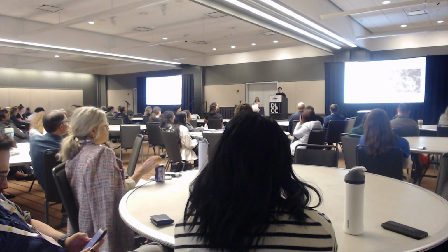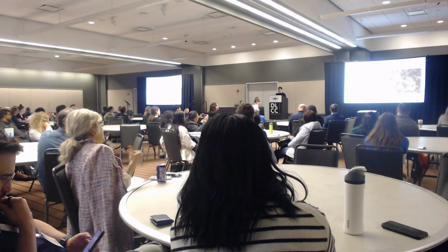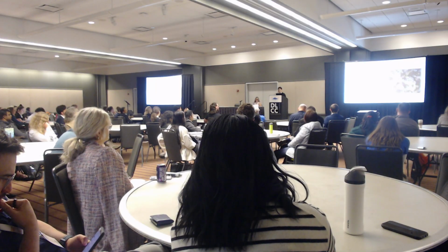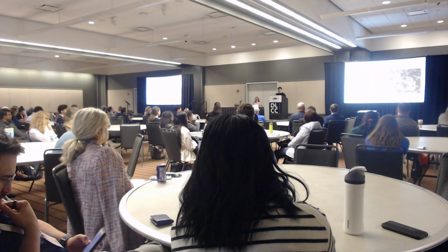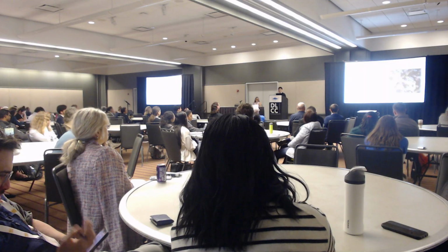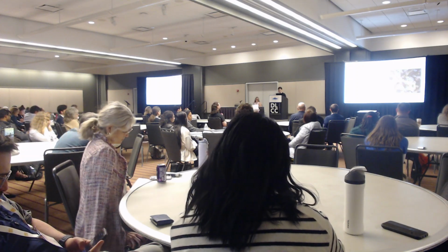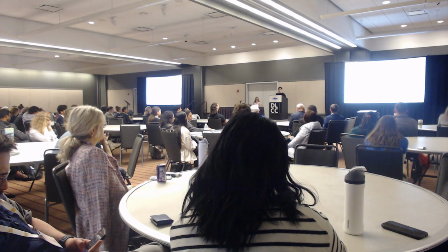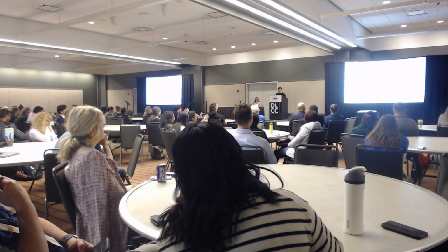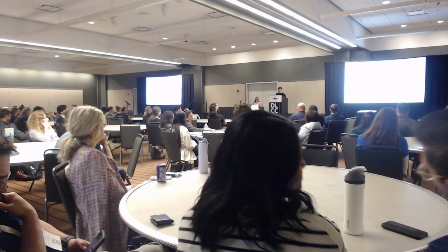For imaging-based methods, most of them use in situ hybridization or in situ sequencing, where you can get very high spatial resolution, down to subcellular resolution, and you can get single molecule signals from within the individual cells. However, we need to design specific probes to target the molecules of interest, which will limit the coverage of the genes you profile. On the other hand, NGS-based methods can achieve genome-wide profiling, which is an unbiased method. However, this technology has limited spatial resolution, which is always limited to a spot-like resolution.